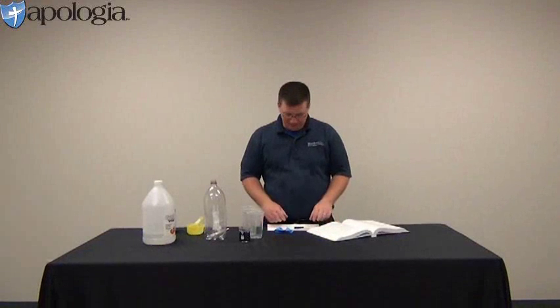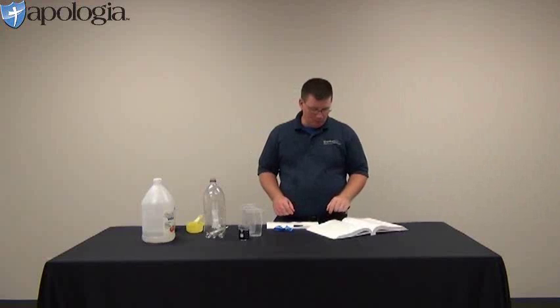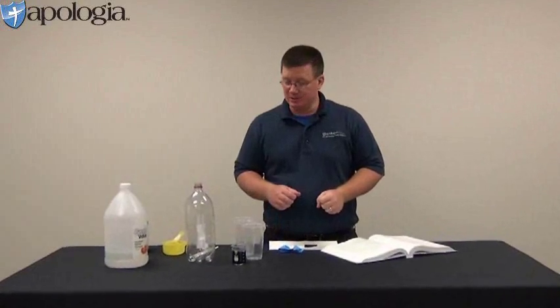Experiment 12.2, the products of combustion. Here for this experiment, step number 1 through 6 is going to require you to make some of that cabbage juice that we've used a couple of times.